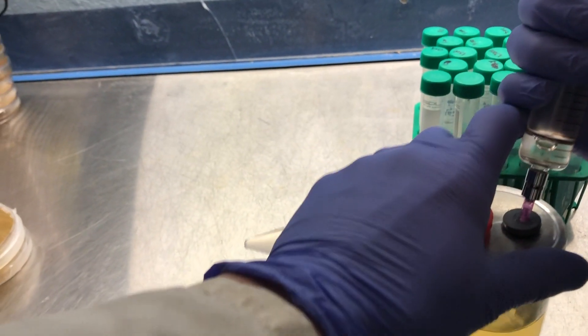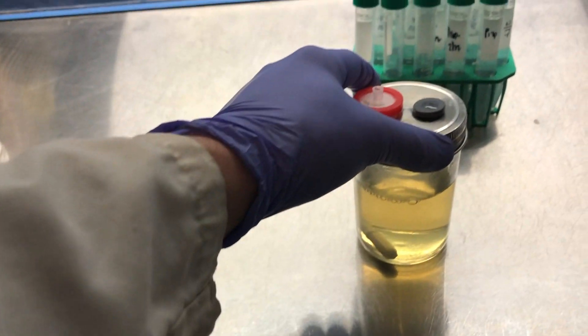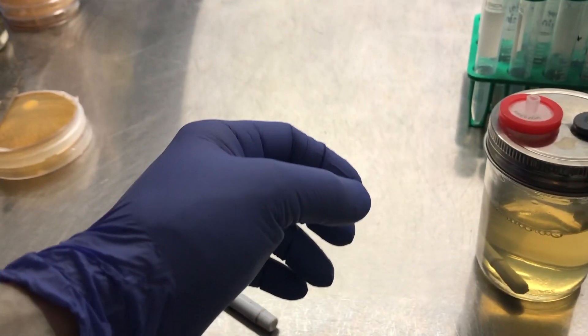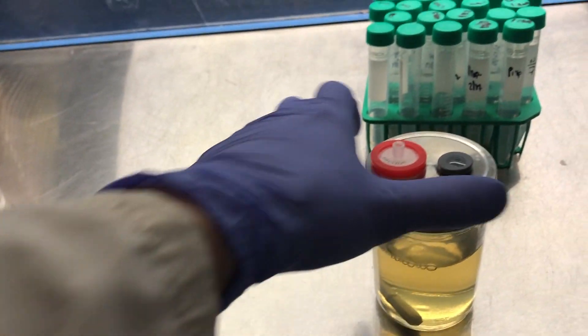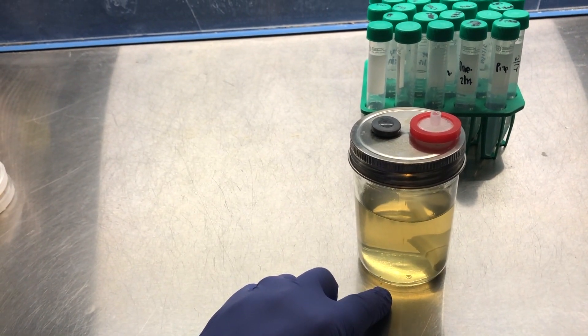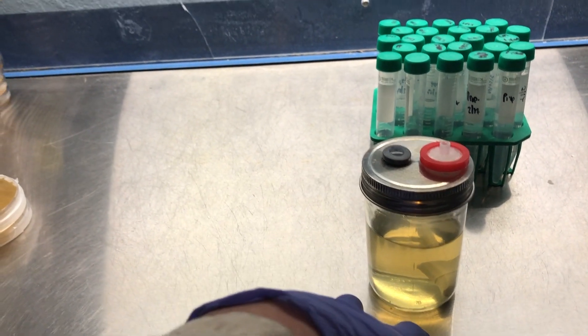Alright, so now I'm just going to be adding the 2 mils of the spores. There should be about 4 CFUs of viable spores in that solution, maybe a little bit more because the spores have been hydrating in that water. Then the spores should begin to germinate in the next 24 hours or so.